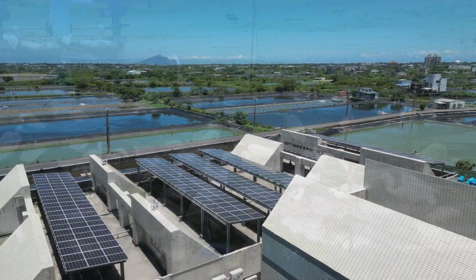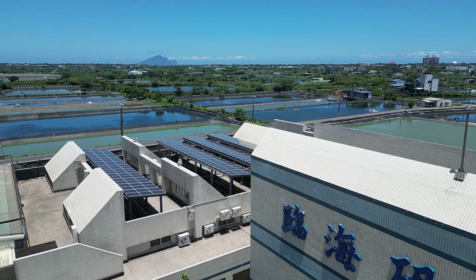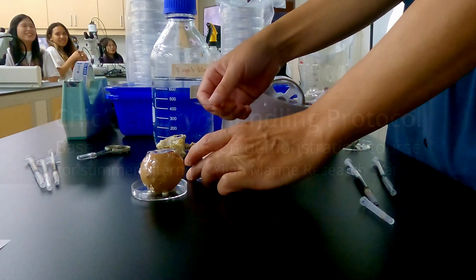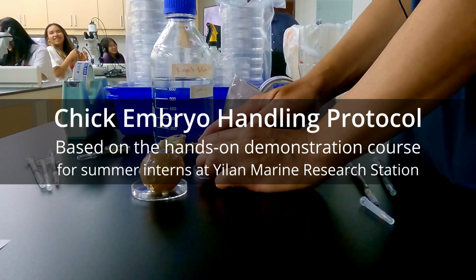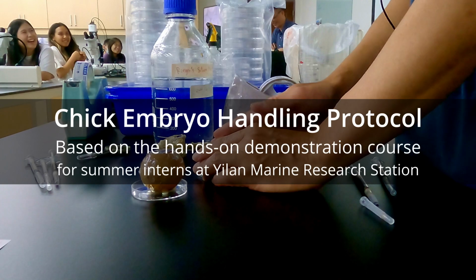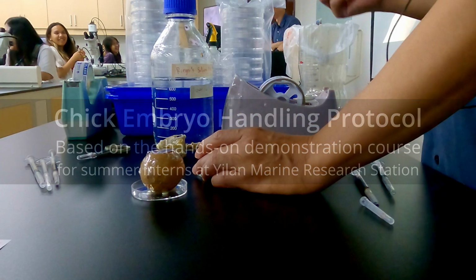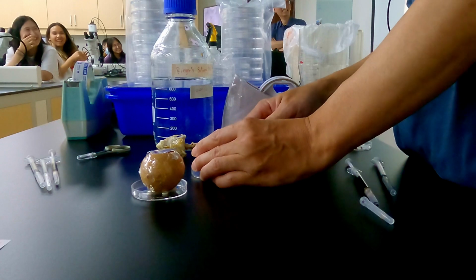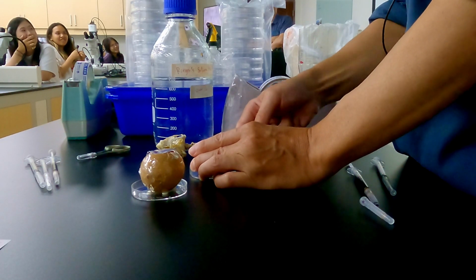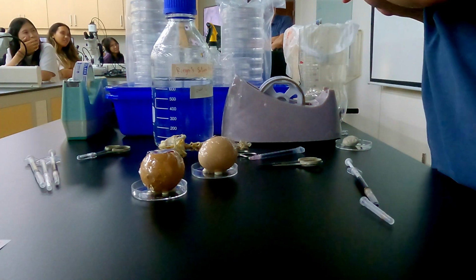Right. And the source we're digging into today, it isn't your standard textbook, is it? Though it definitely connects to textbook concepts. No, not a textbook. It's essentially based on a script for a video guide, a practical one. So like a hands-on tutorial. Exactly. Teaching a core skill, how to handle chick embryos for histological analysis. Think of it like a workshop, but in audio form. Okay, mastering a specific process to actually see what diagrams only hint. That's the idea, to unlock that visual understanding.